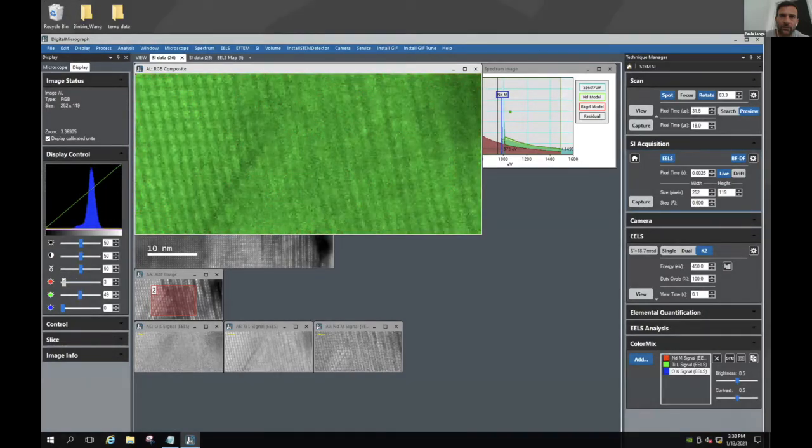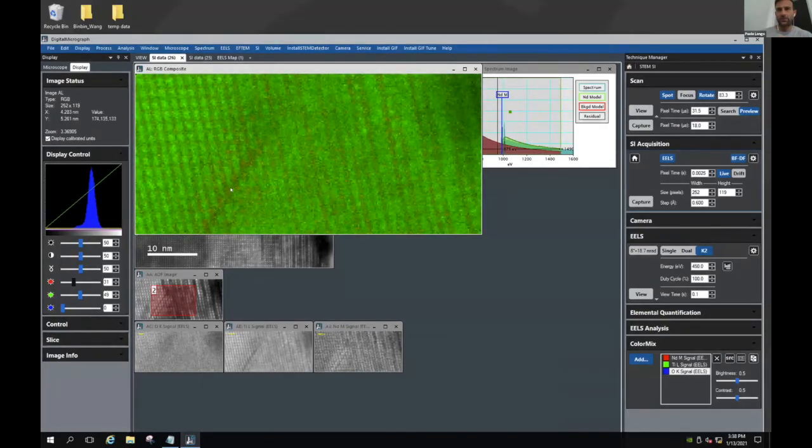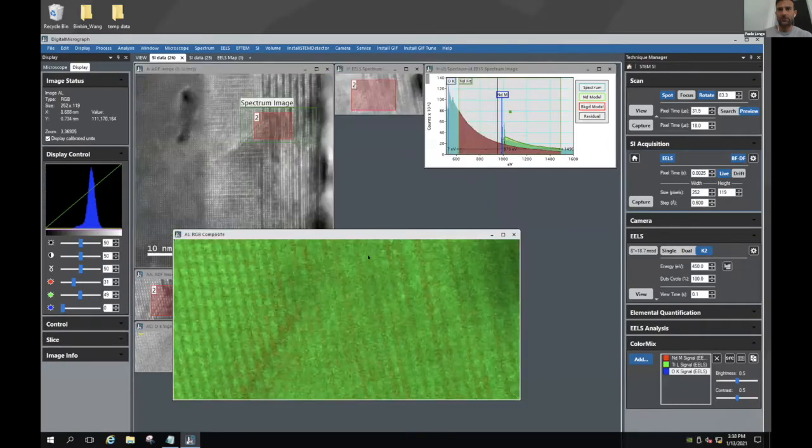The neodymium. So the neodymium is gone. You can see where the neodymium is sitting there very nicely. And this is not a probe-corrected instrument, but you're able to do the same thing you do with the probe-corrected instruments. You have some regions here where there might be different neodymium. So we can just leave it like this, and let's go analyze our spectrum.